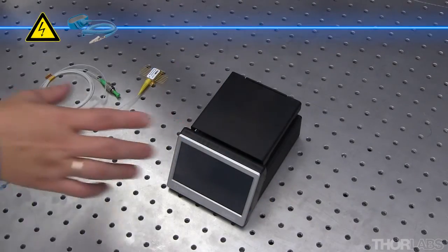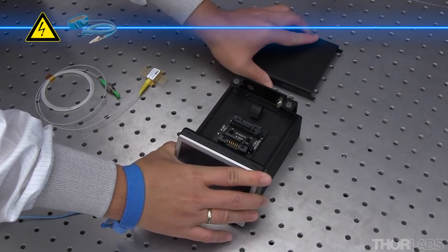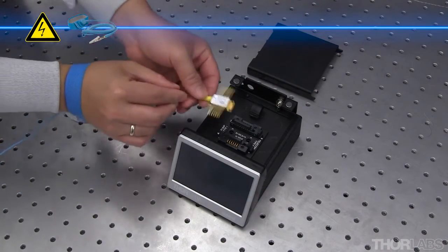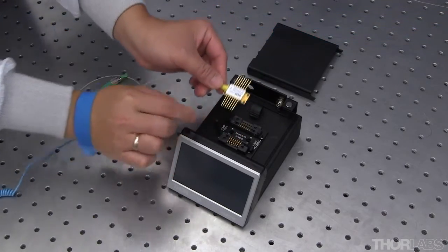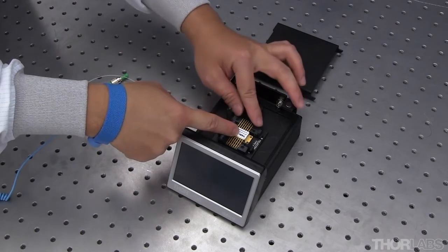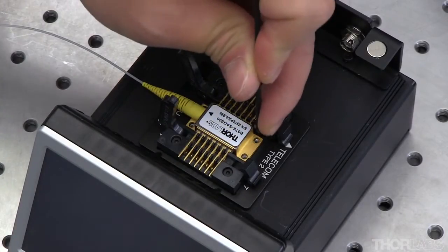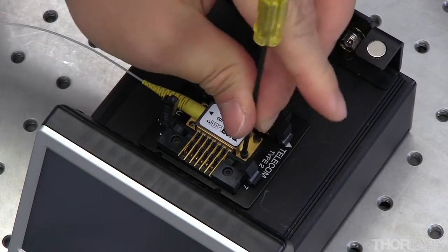Next, we want to install the laser diode into the integrated current and TEC controller. ESD protection should be used at this point. The 14-pin butterfly package should fit easily into the controller's socket. Ensure that the pigtail is oriented in the type 1 direction. Secure the diode to the controller with the included screws and socket clamps.